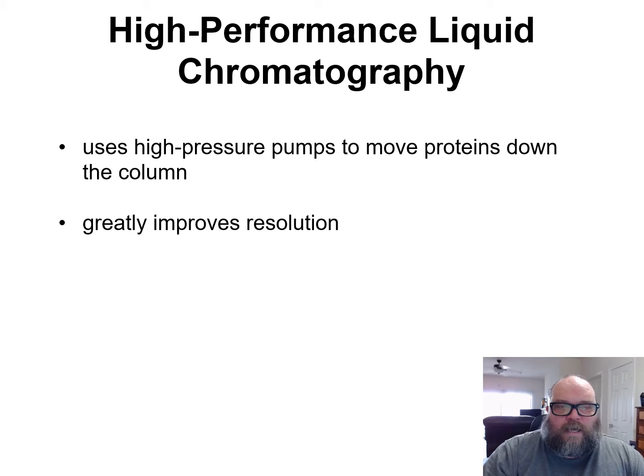Well, nowadays they have what's referred to as high performance liquid chromatography. HPLC is the acronym for it. This will use pumps, the same gels, the same microbeads and all of that, the same buffers, the same wash buffers, same release buffers. But now it's using pumps and high pressure. So instead of taking anywhere from 20 minutes to an hour, like it would if you did it the old-fashioned way, using just gravity and the weight of the liquid to push through, now you're doing it under pressure, and it can do all of that within minutes.